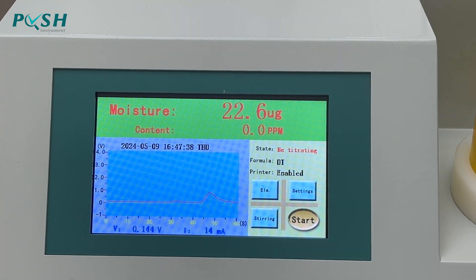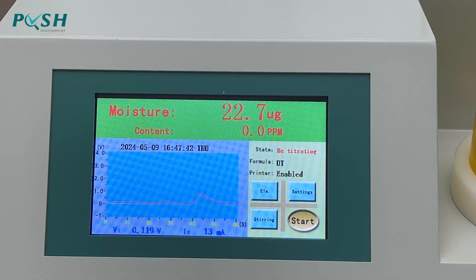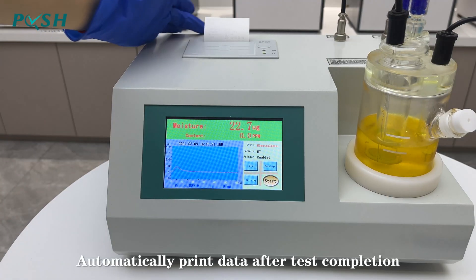Waiting for test results. Data is automatically printed after test completion.